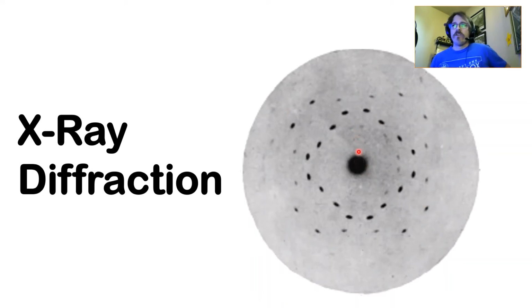And so what we have here is a diffracted beam, and the center beam is the transmitted beam. The other beams are the diffracted beams, and these spots are patterns, and depending on the crystal structure and the orientation of your crystal, you will have a different pattern. Learning how to interpret these orientations becomes a good art. We'll talk a lot more about pattern-based diffractometry when we talk about transmission electron microscopy.